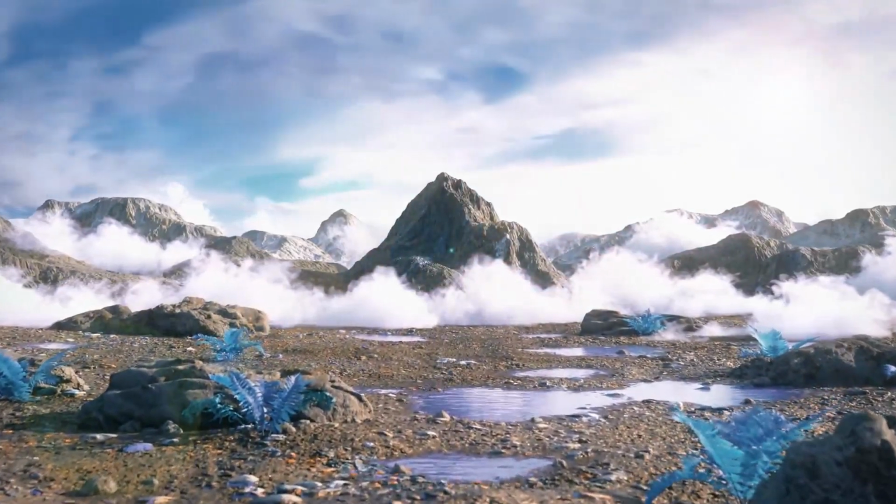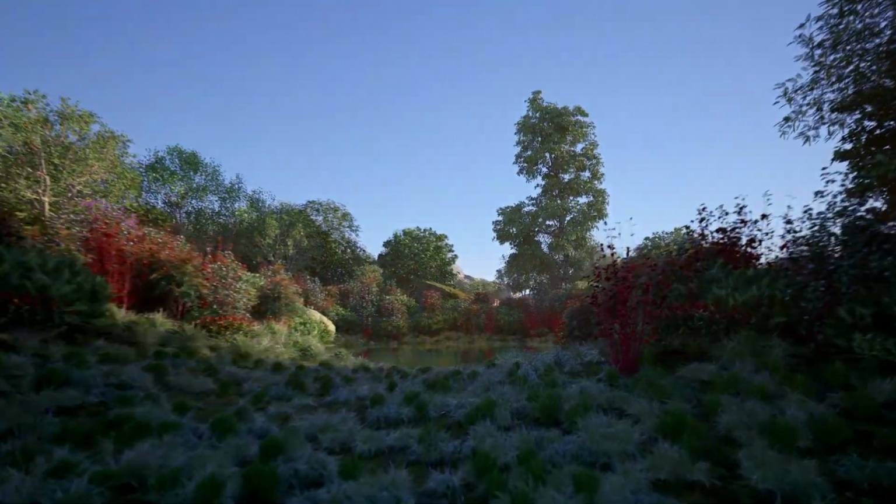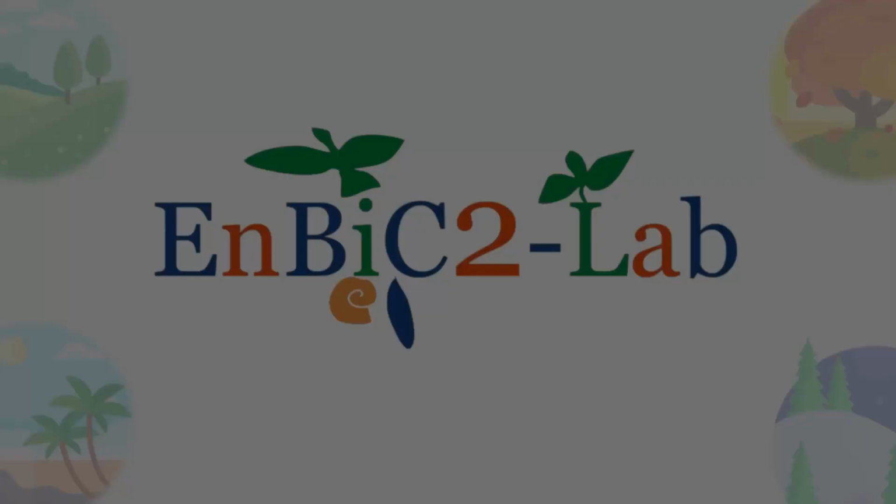Welcome to the introductory explanation on the EnBiC2-Lab project Excel soil workflows.